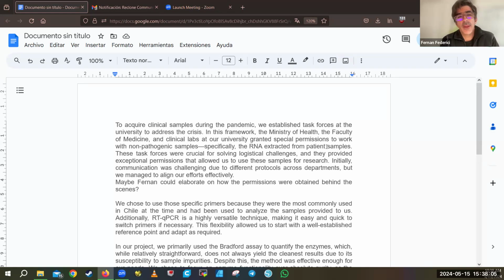So Paola, a student from Peru in our group, is studying waterborne pathogens, Cryptosporidium. She put together a protocol for using the PFU enzyme to reduce the cost of that work, and it has worked really nicely.